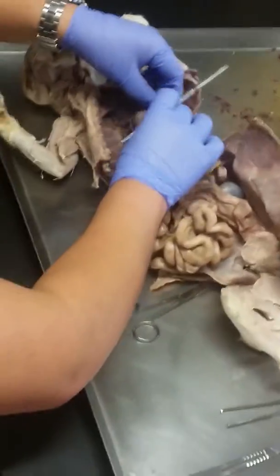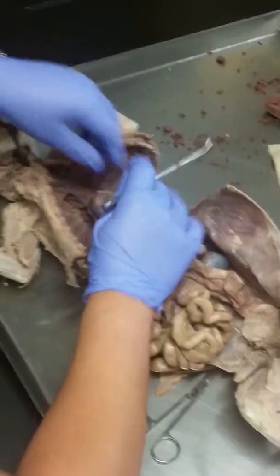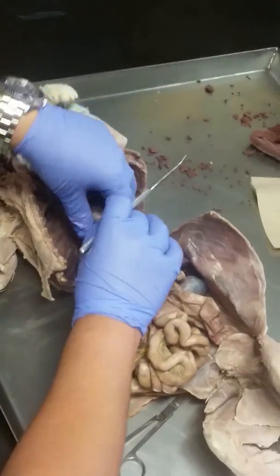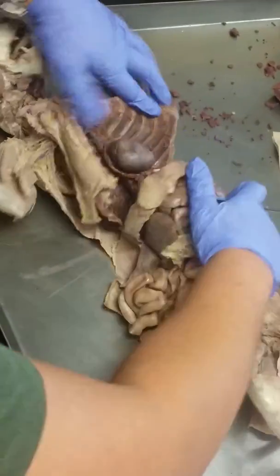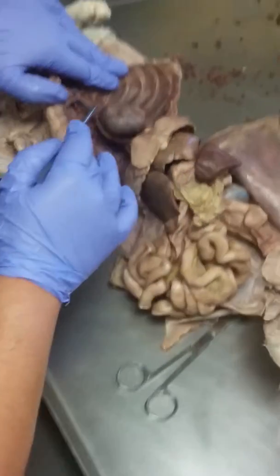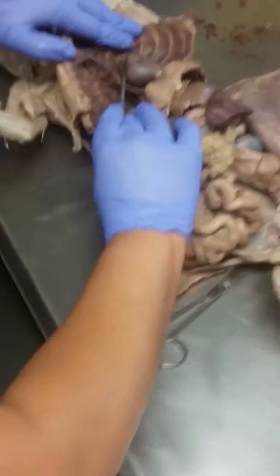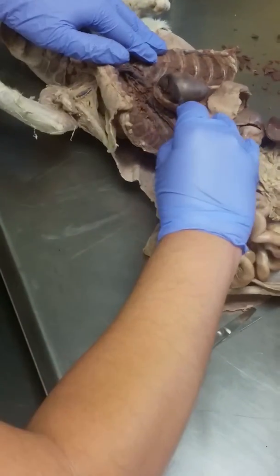You're going to cut the pericardium. Remember, the pericardium was the sac that the heart sits in. You want to remove that so you can take a look at the heart itself. Look at that. Notice this structure right here. See that structure? What do you think this is?